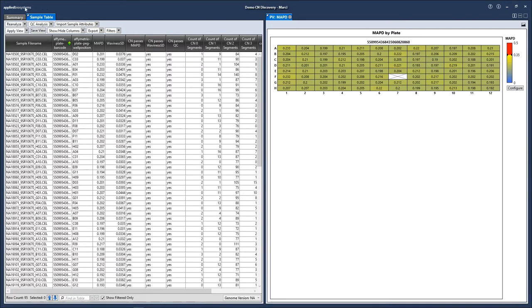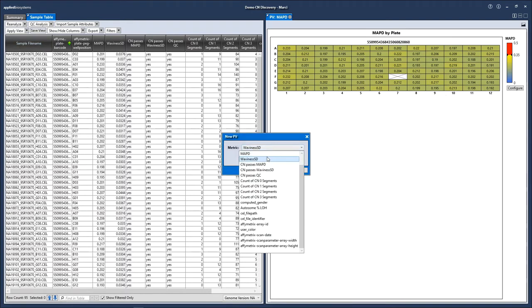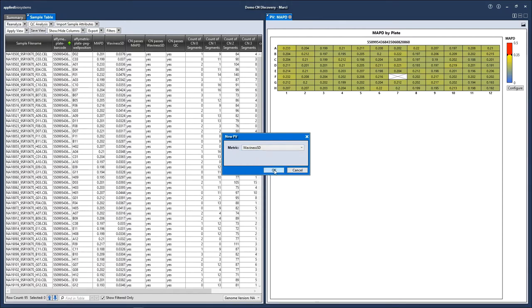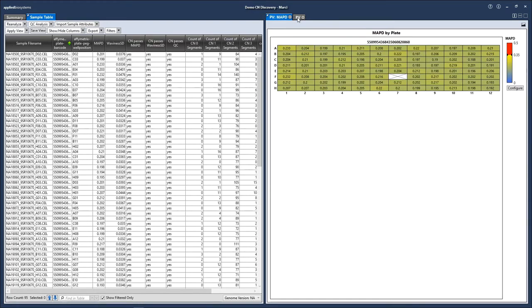After the analysis finishes, from the dashboard tab, we can just click open for the copy number discovery batch. The copy number discovery batch allows for the display of several tables and visualization tools. Let's look at the drop down under QC analysis from the sample table. The top three options here are for the visualization of the QC metrics. By default, I have a plate view of the MAPD values on the right hand side, but I can also choose to generate a plate view of another metric, for example waviness SD.